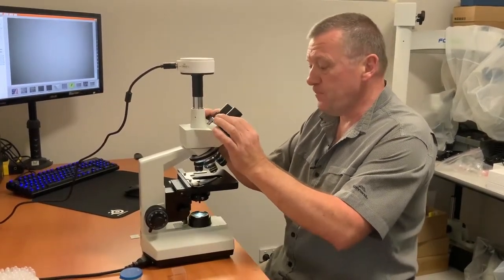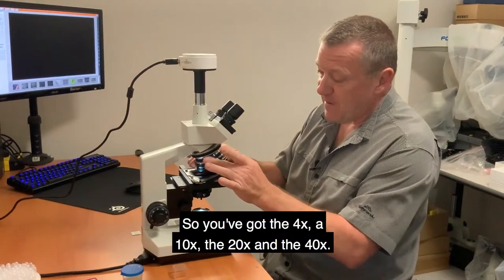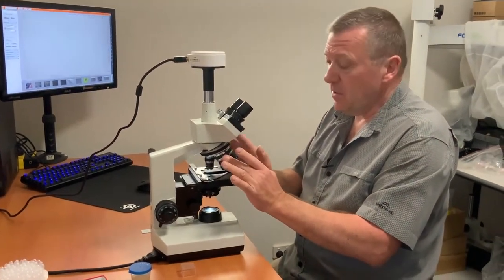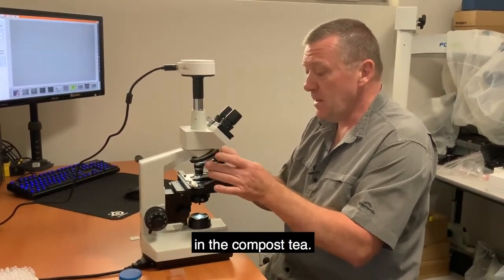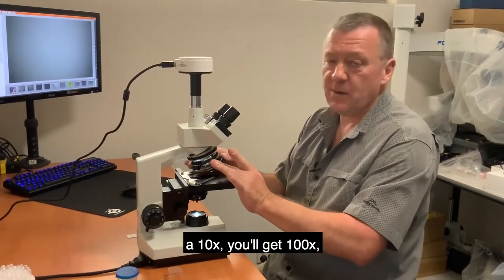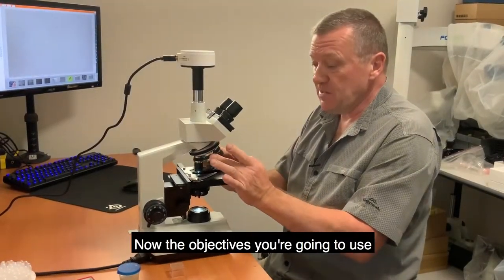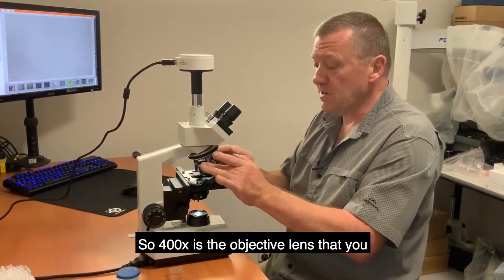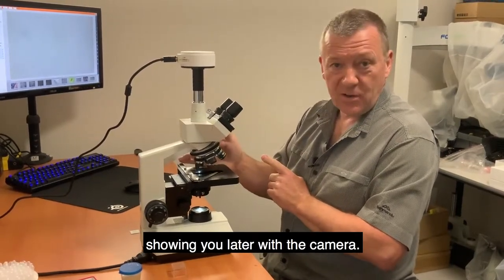This microscope has four objective lenses: the 4x, 10x, 20x, and 40x. These are the four objectives most important for looking at microbes in compost tea. Through the 10x eyepieces that gives you 40x, 100x, 200x, and 400x total magnification. The objectives you'll use most are the 40x and 20x, so 400x is what you'll mostly use when looking at compost tea.